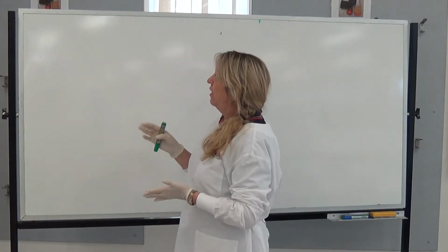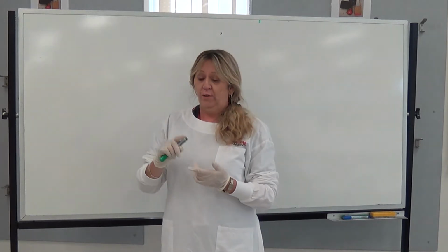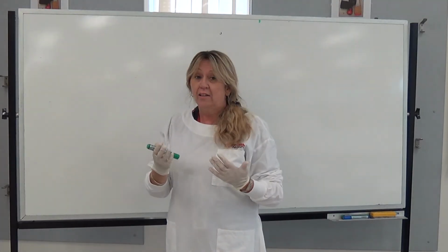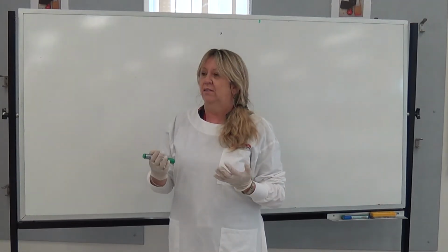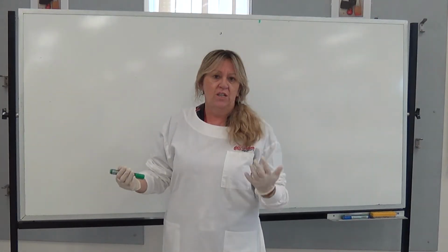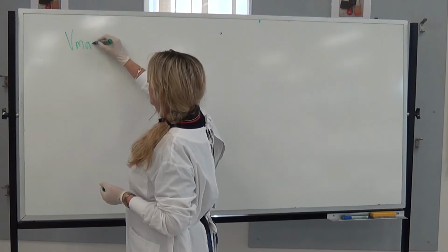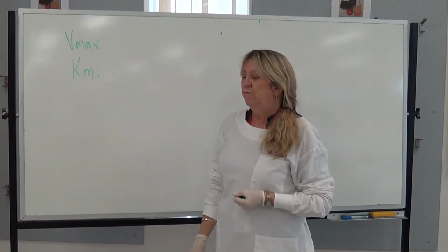All right, so now we're going to look at these 4 different alcohols in our lab. So ethanol, methanol, propanol, and isopropanol. We've just seen how they can fit or not fit into that active site of our ADH. And that's great, but how do we monitor this? How can we say that one is more preferred to the other? So we're going to look at something called Vmax and Km. So at the moment, they don't really mean much.